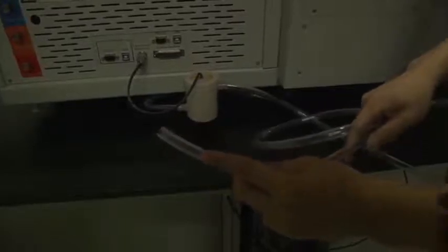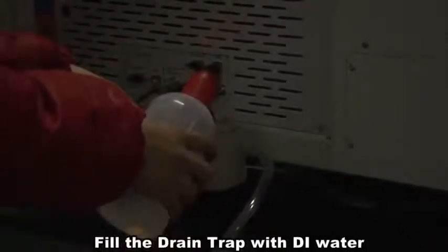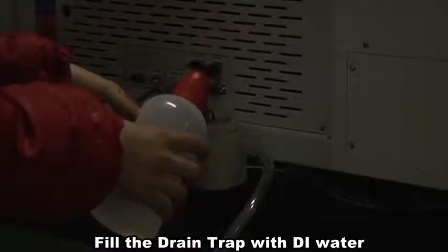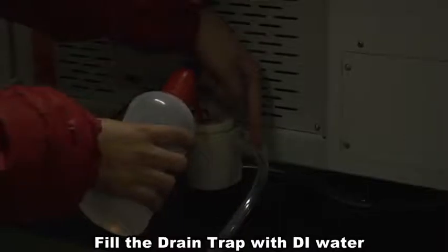Fix the trap onto the system. Place the other side of the tube into the waste bottle. After installing the liquid trap, fill it with DI water through the hole on the top until there is water flowing through the tube.